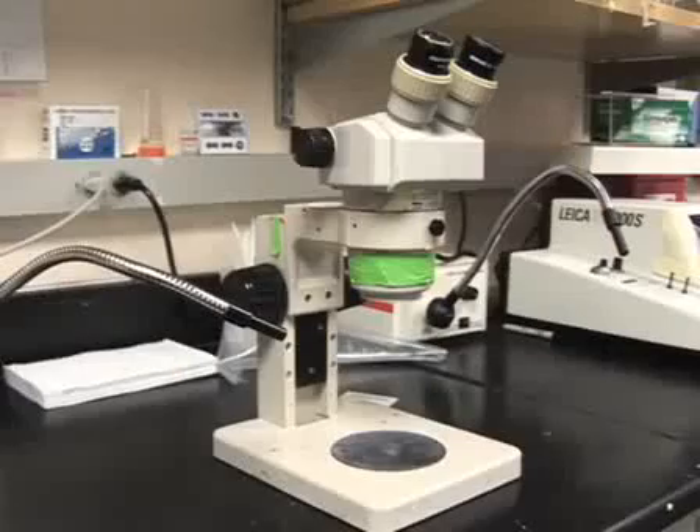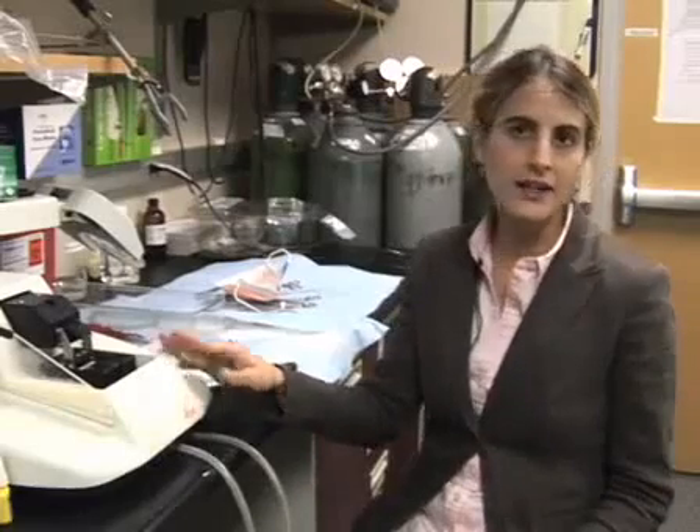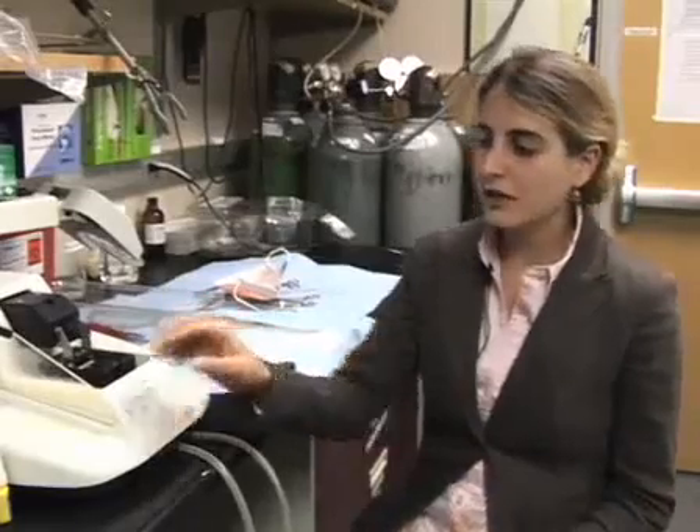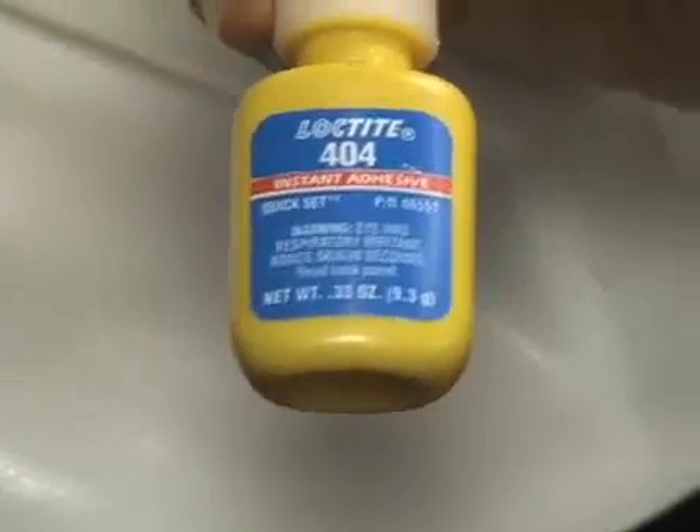There are a few important tools and reagents that we use for the slice culture procedure. You'll need a dissecting microscope to dissect out the brains. We also use this Leica VT1000S vibratome, which is a good system for cutting your slices. The glue can be important — we use this Loctite 404 glue, which adheres the brains very well, because sometimes if you use the wrong type of glue the brains will come off when you're trying to cut them, and that can be problematic.